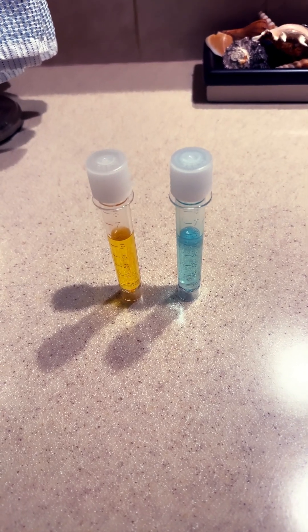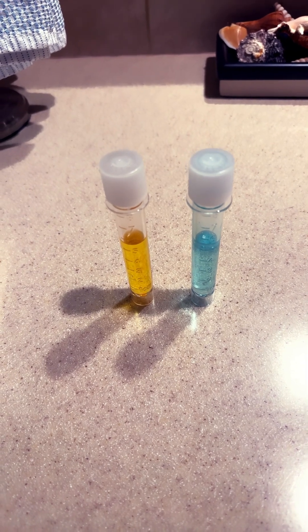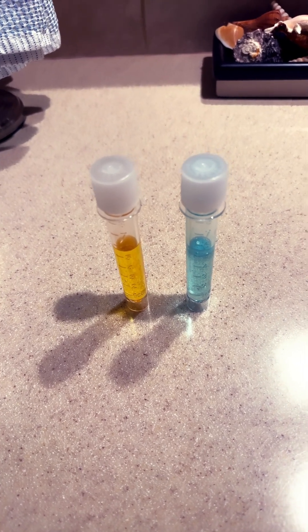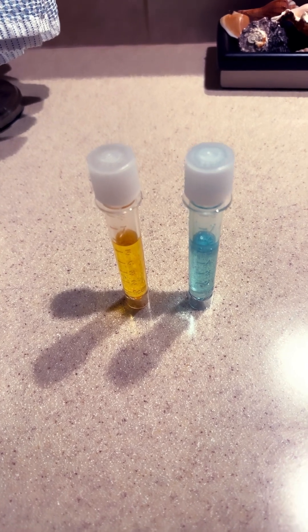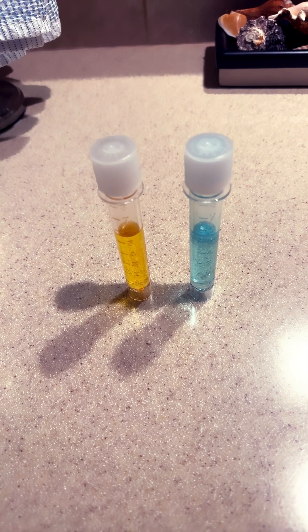If anyone is looking for what an API kit will give you in a perfect ammonia and nitrite reading, this is what it should look like. I don't use the original glass bottles that came with these.